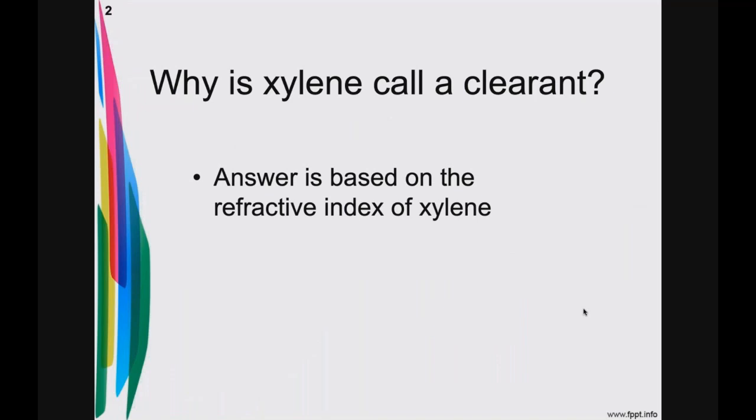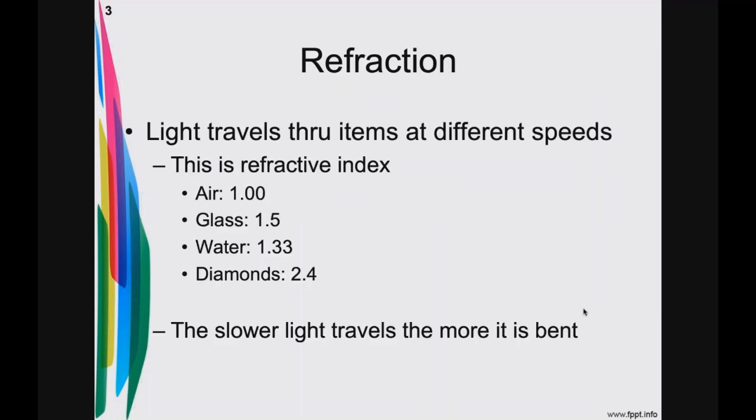Before we get into the topic of xylene versus xylene substitutes, I want to tell you where that term clearant really came from. It's quite old in the literature. It turns out that the answer is based on the refractive index of xylene, okay? And so what is this refractive index?